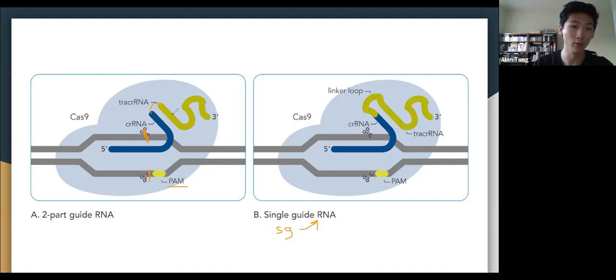And then we have to worry about, oh, will those two find each other? Will they associate, right? It's very complex. And so by linking them together, we can artificially make this a more efficient system, and we can make it do our bidding. Hopefully that answers your question.